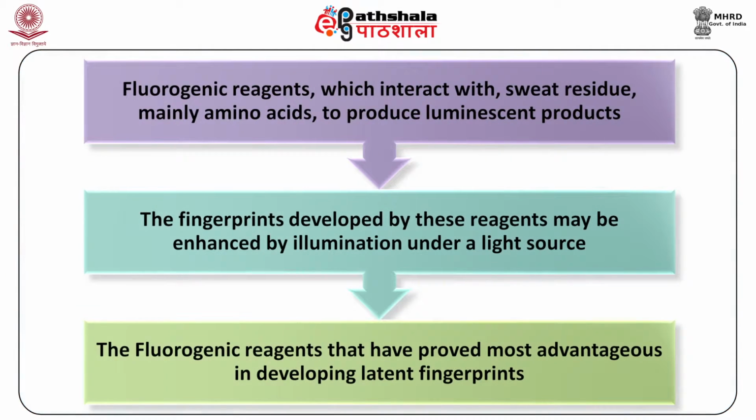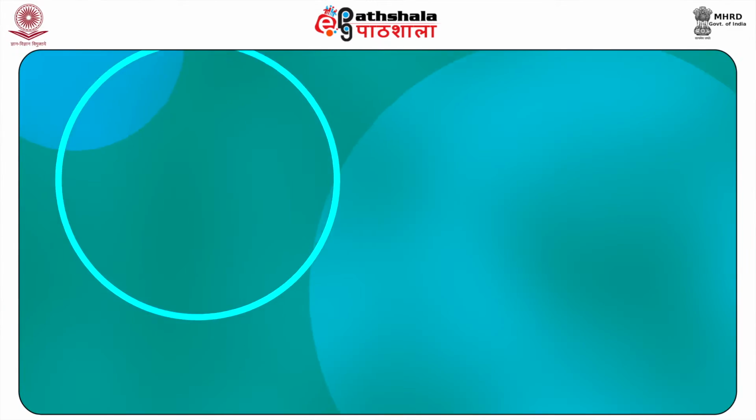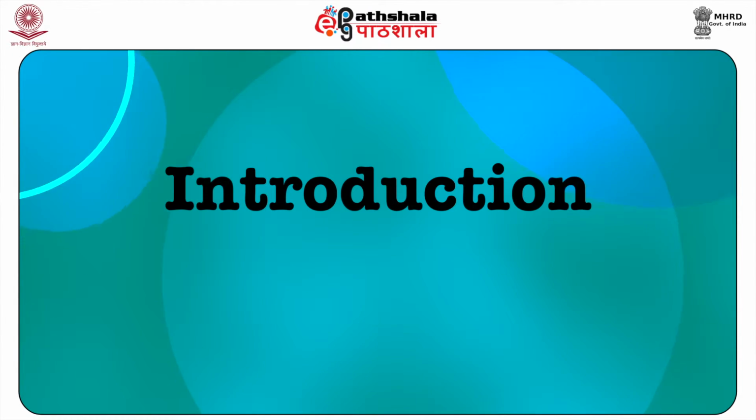Dear students, after learning this module, you shall be able to know about fluorogenic reagents which interact with sweat residue, mainly amino acid, to produce luminescent products. Then you'll learn that the fingerprint developed by these reagents may be enhanced by illumination under a light source. And finally, you'll come to know the fluorogenic reagents that have proved most advantageous in developing latent fingerprints. Now, let us start with the introduction.